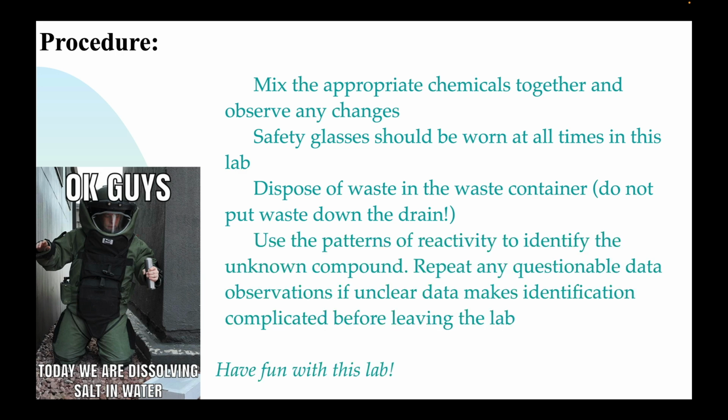The patterns of reactivity will help you to identify what the unknown compound is. So the unknown will be one of those four knowns: NaCl, Na2SO4, Na2CO3, or Na2HPO4. And your goal is just to figure it out, all right? And make sure that you write down the unknown letter that you get. We're going to use letters on this lab, I believe, and the letters will be really important, so write it down.